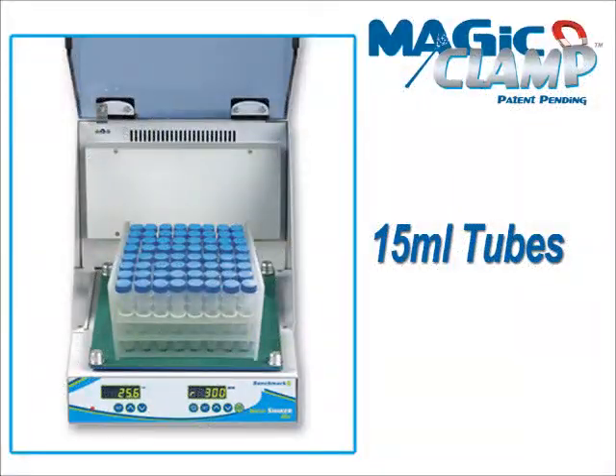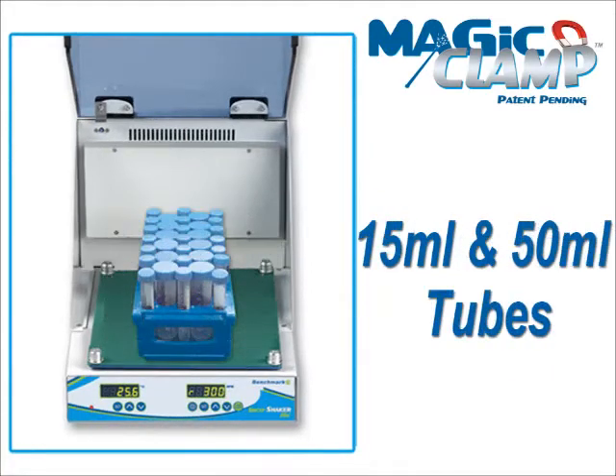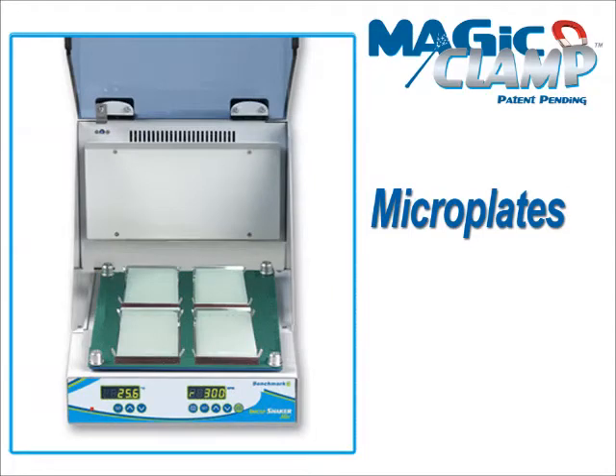In addition to convenience, the Magic Clamp System also adds versatility. While many traditional platforms are only designed to hold flasks, the Magic Clamp platform holds a variety of racks for tubes, bottles, and plates.